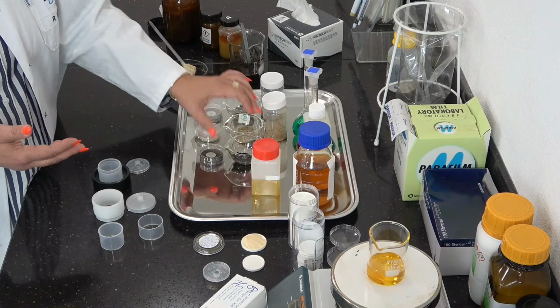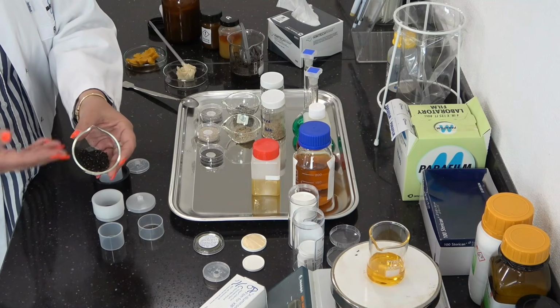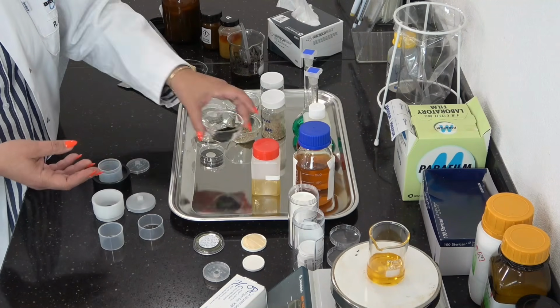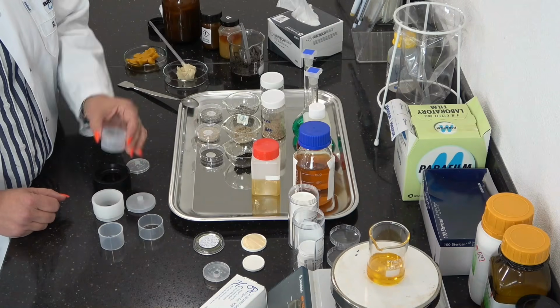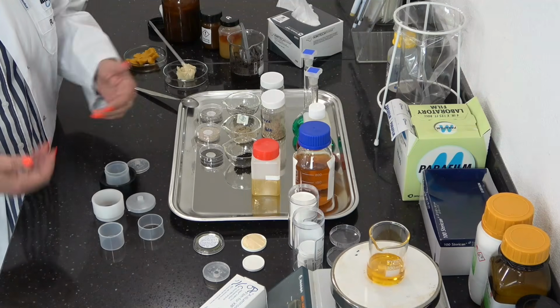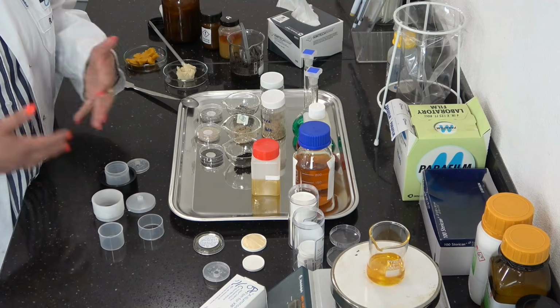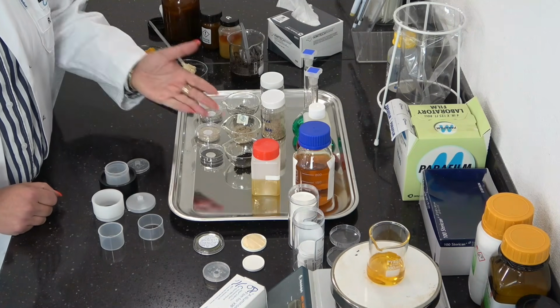Here I do have some rooftop materials. So you can cut the samples, or if you dry the sludge and slurries, you will have a powder, which can also be analyzed as a powder in the liquid cup. So first of all, this will also improve the matrix effect a little bit more. You do not have to define, let's say, a complex matrix in the software. So this is one way.